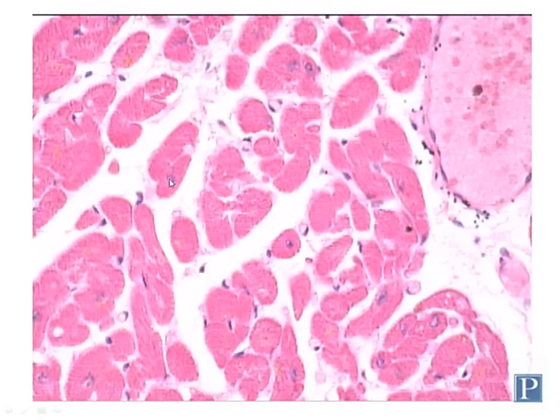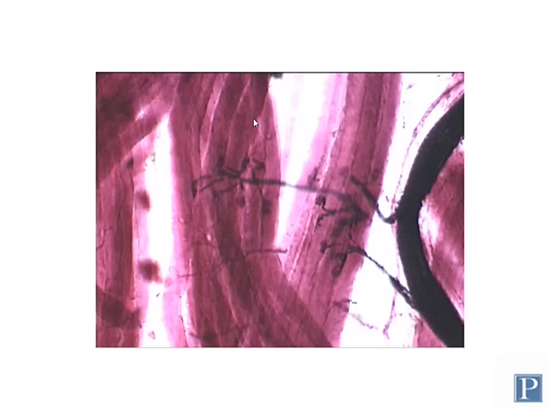You will not see that in skeletal muscle. Remember, they're at the periphery. Many cardiomyocytes, you may not even be able to see the nucleus. That's because they only have one or two, so you may not have it in a section. With skeletal muscle cells, you're almost always going to see multiple nuclei within every section because the nuclei are so abundant. So those are all different visual cues you can use to distinguish between those types of muscle cells.